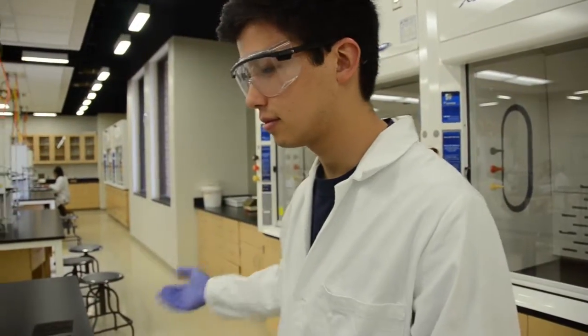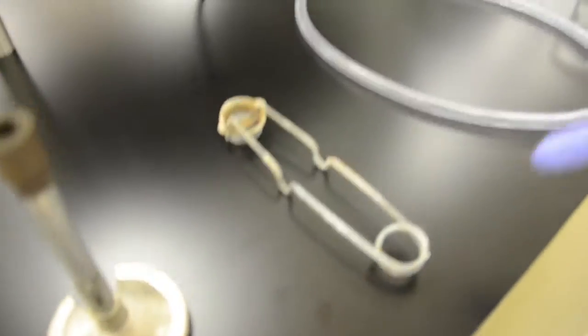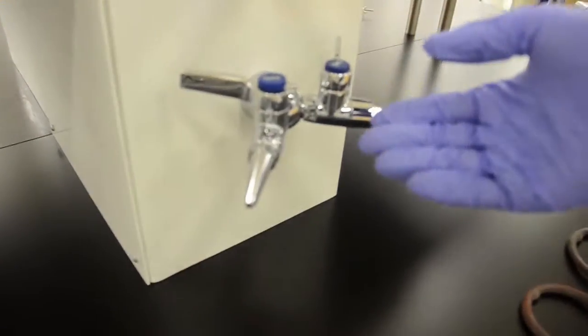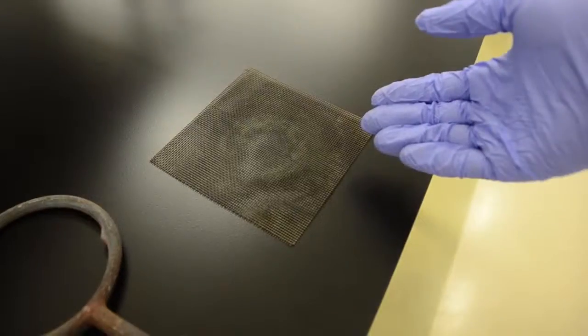First, make sure you gather all the necessary materials in order to start your Bunsen burner and heat a beaker of water. This includes the Bunsen burner, a Bunsen burner striker, gas tubing, a gas source, a 250 milliliter beaker, two ring clamps, and a wire mesh screen.